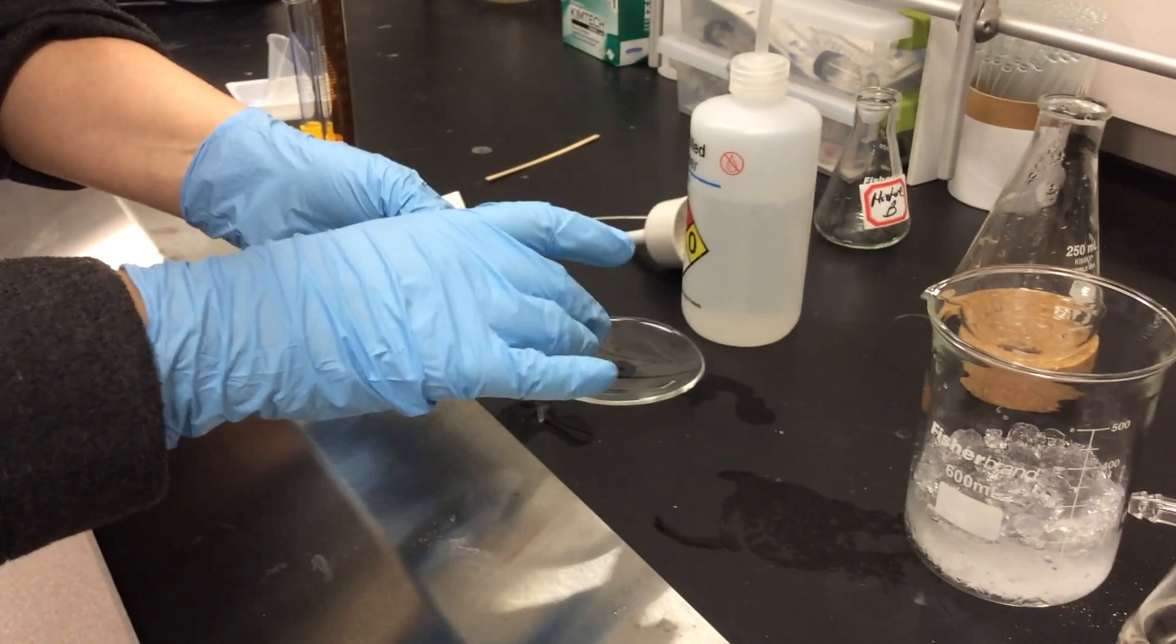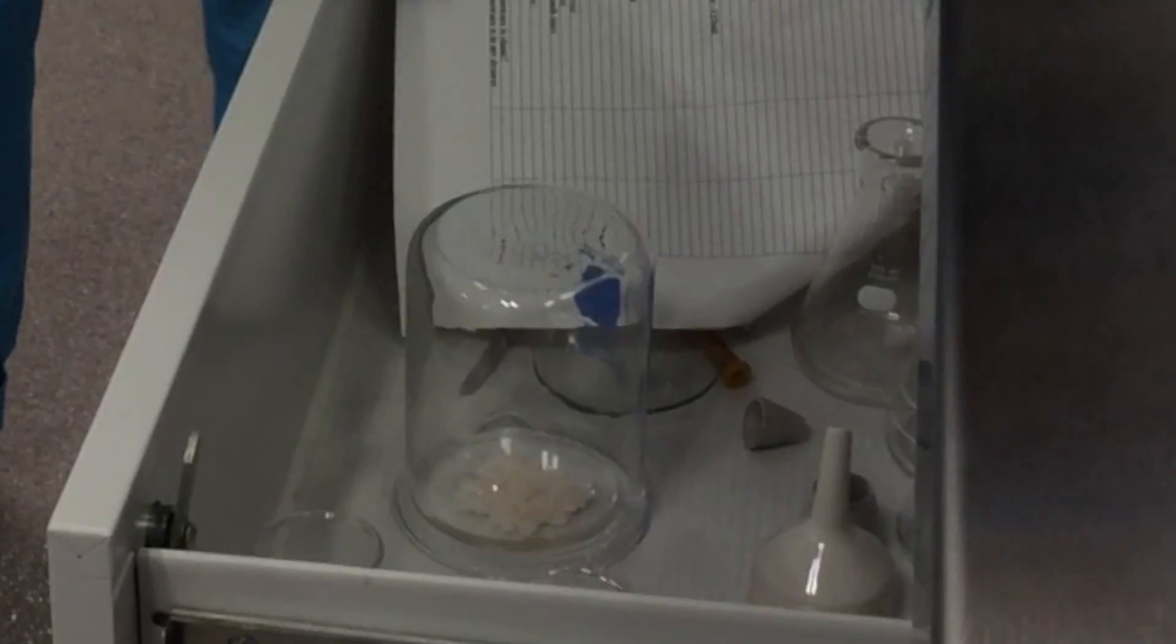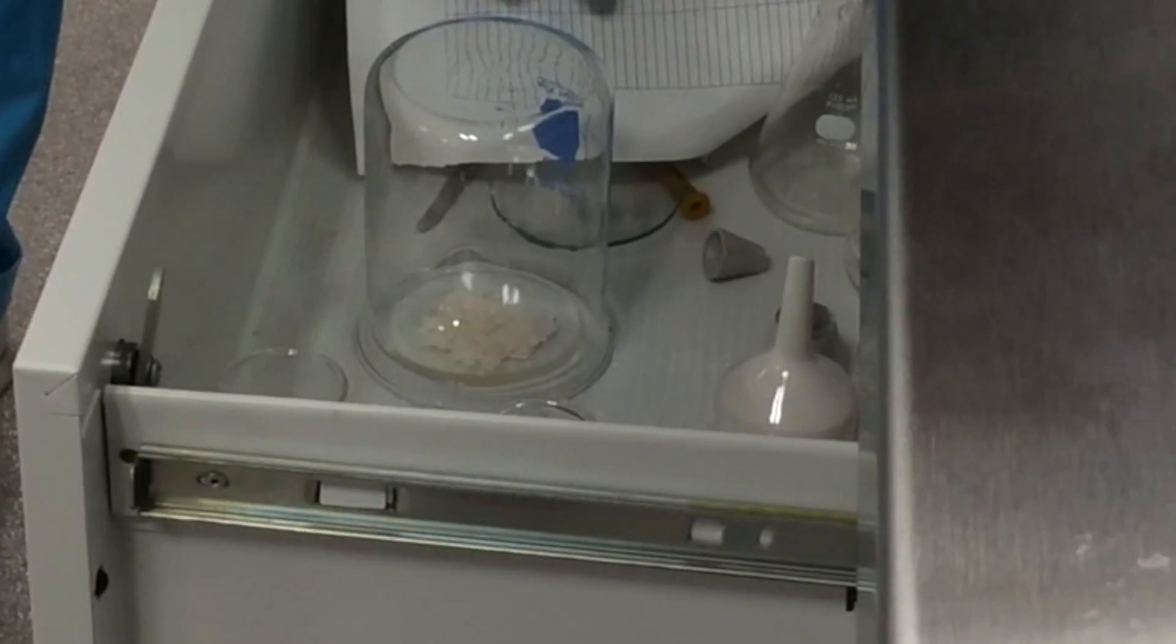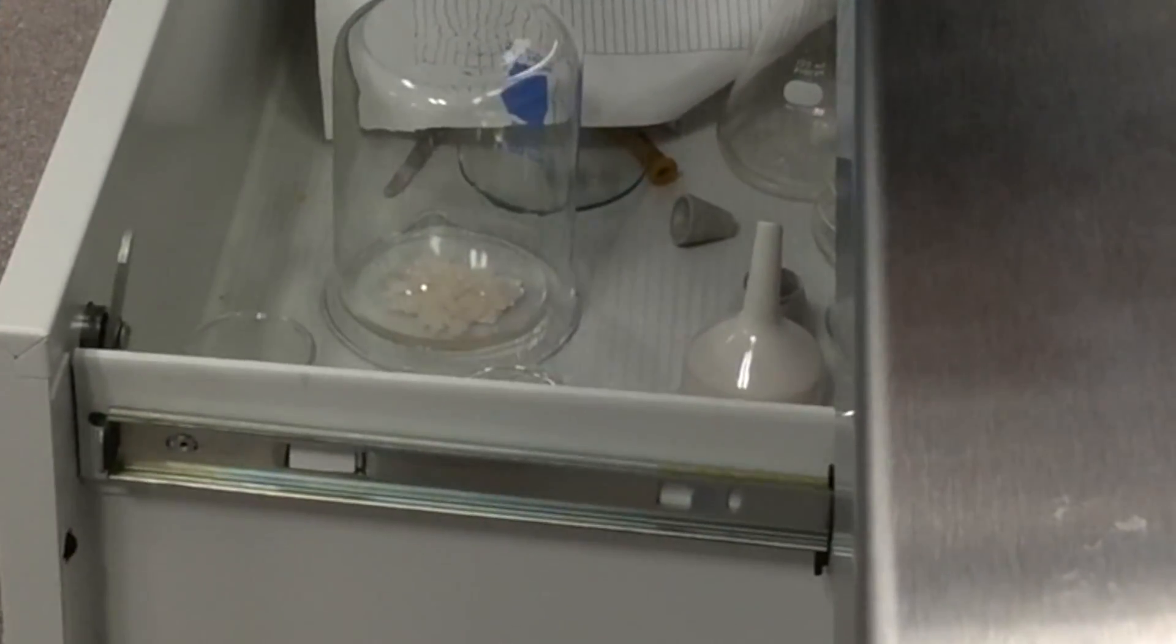What we're now going to do is label the bottom with a label acid anilide. Now we're going to put our pure crystals in our drawer, cover it with a beaker, wait till next week so the crystals can be totally dry to take an accurate weight and melting point.